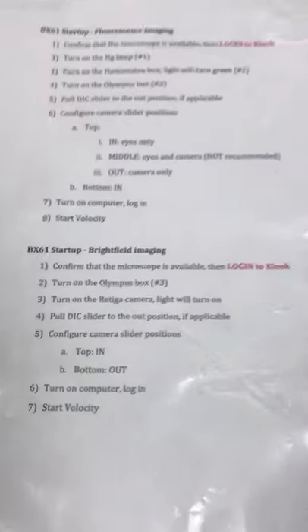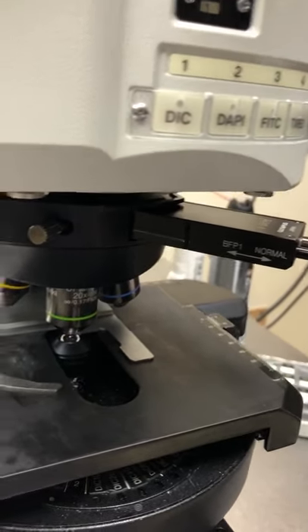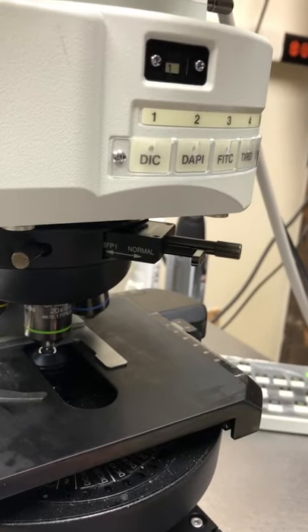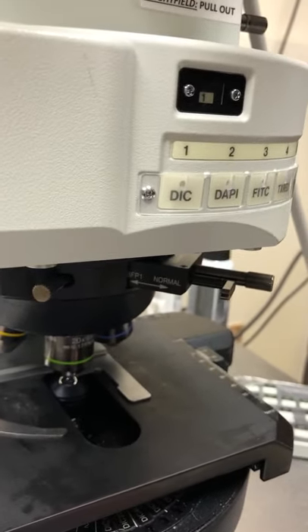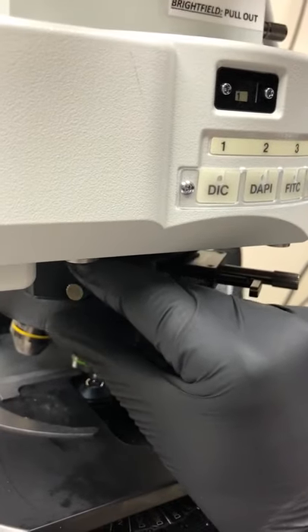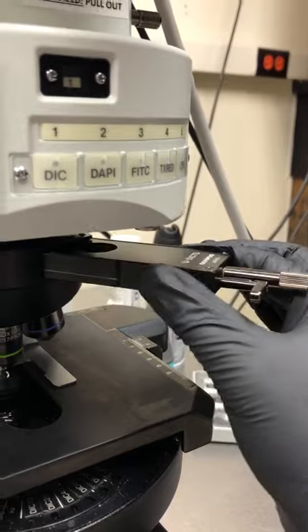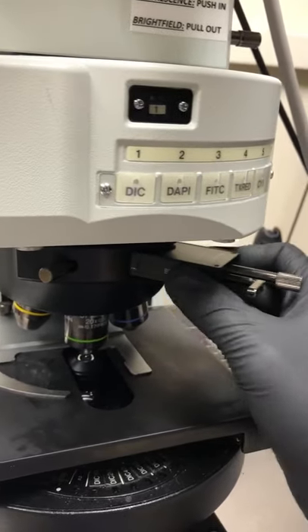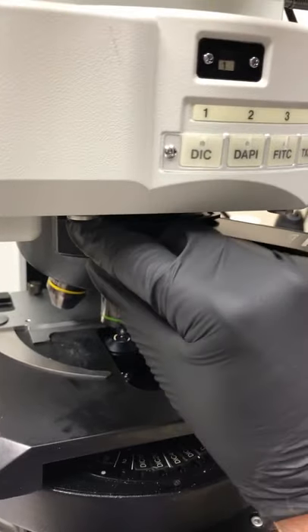Pull the DIC slider to the out position if applicable. This thing here is the DIC slider. The out position is where it is right now. The in position is when you release the set screw and push it in until it clicks. You should not have it in the in position unless you're doing DIC illumination. If you come and the slider is in, release the set screw and gently pull it out until it clicks. If you pull too far, you'll pull the whole thing out — just gently put it back in at a slight angle.